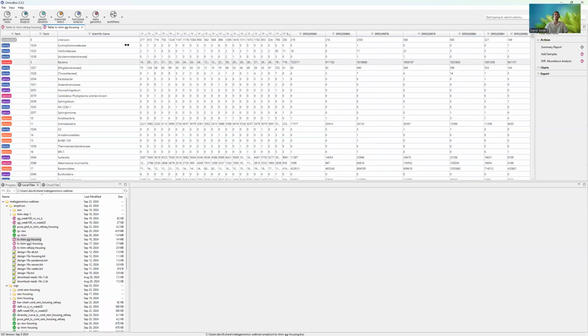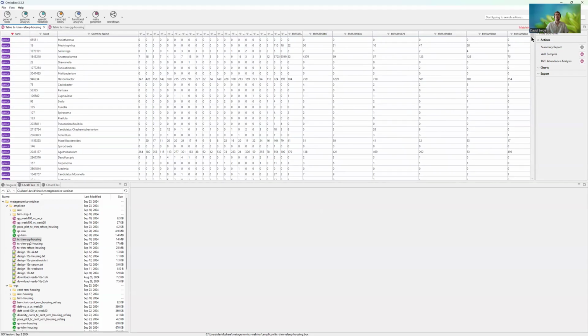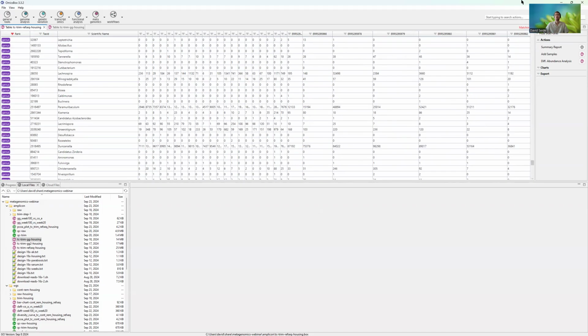With one taxonomy per line. And on the left, we can see the rank. So this is a species, this is a family, this is an order, and we can filter. Maybe I only want to see the genus level here. So everything will be genus.